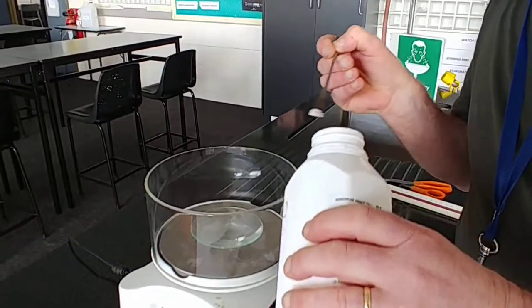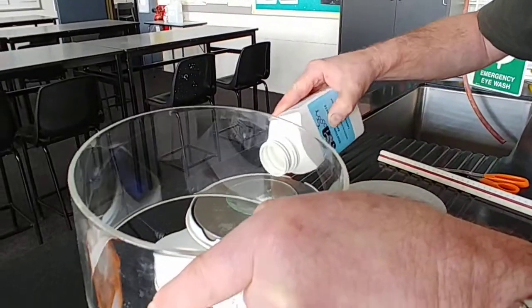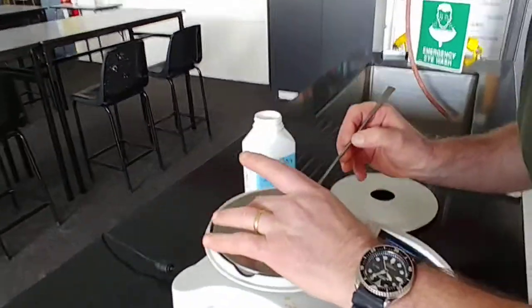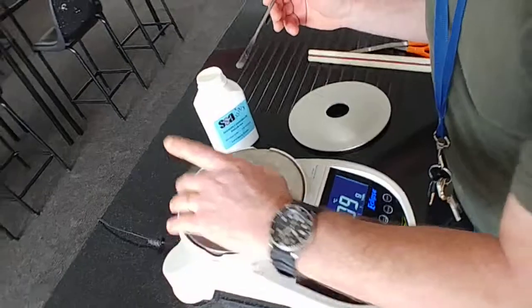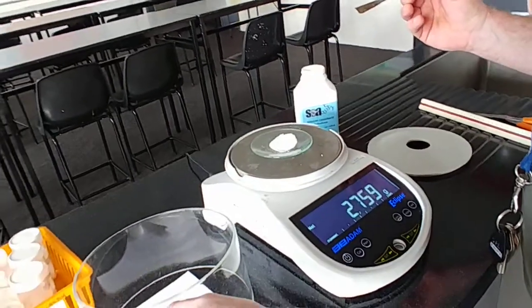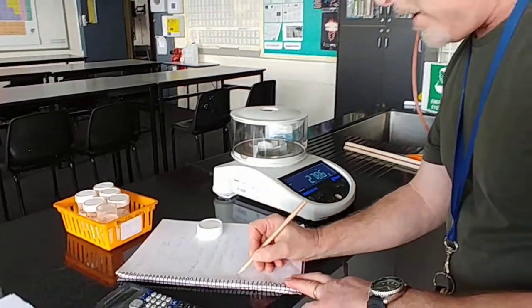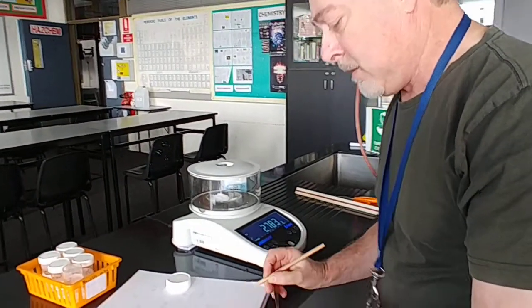We need about 2.6 grams, so let's weigh it out. That's way over. So let me take some out. It's still too heavy. Okay, what we've got here is our weight is 2.783 grams.